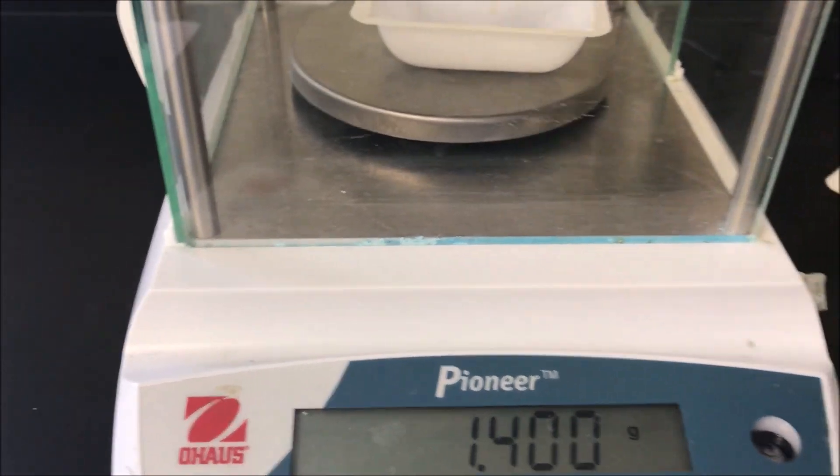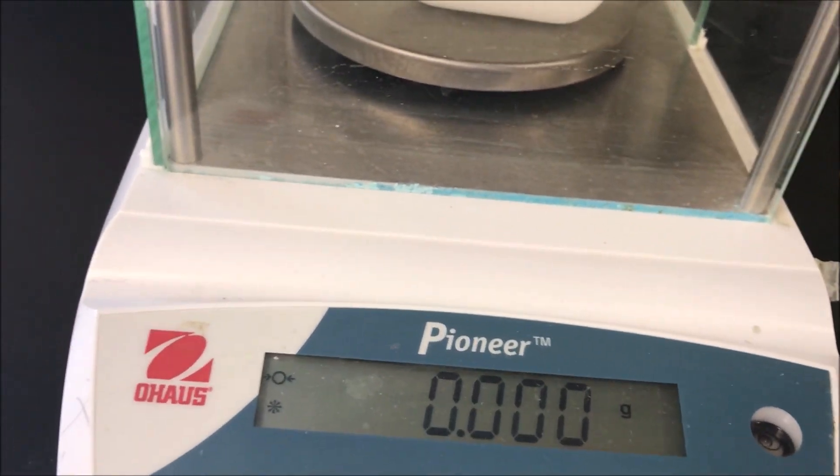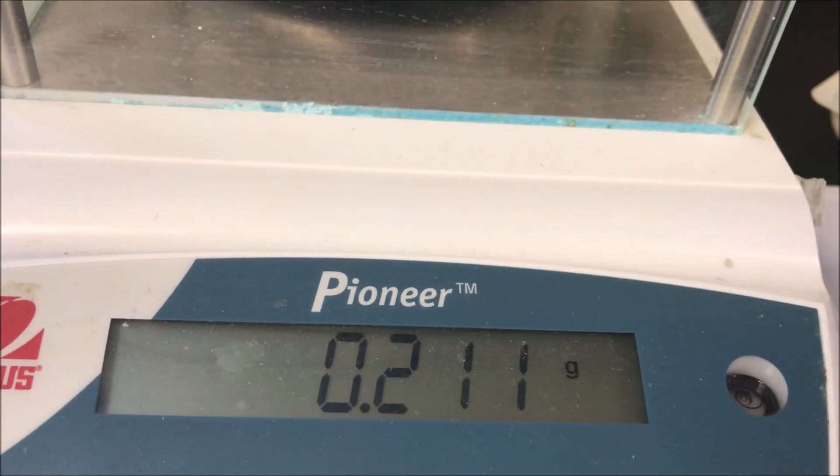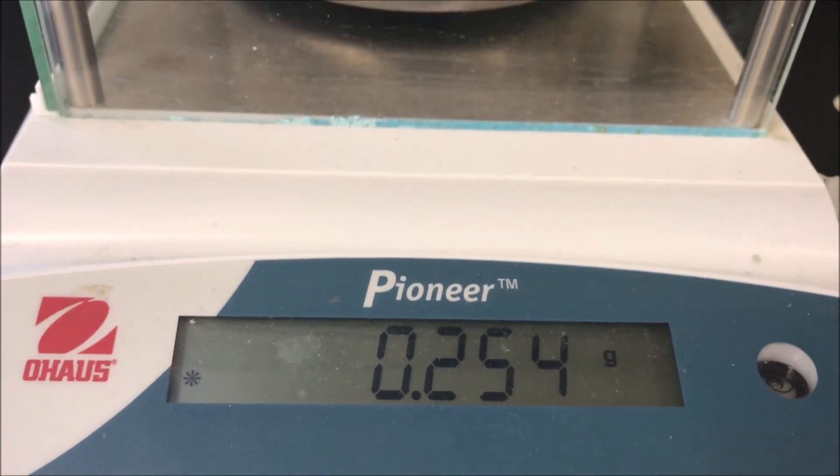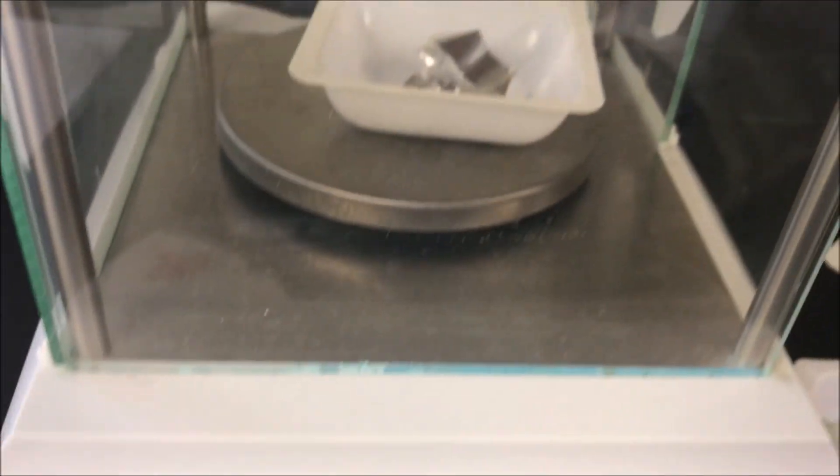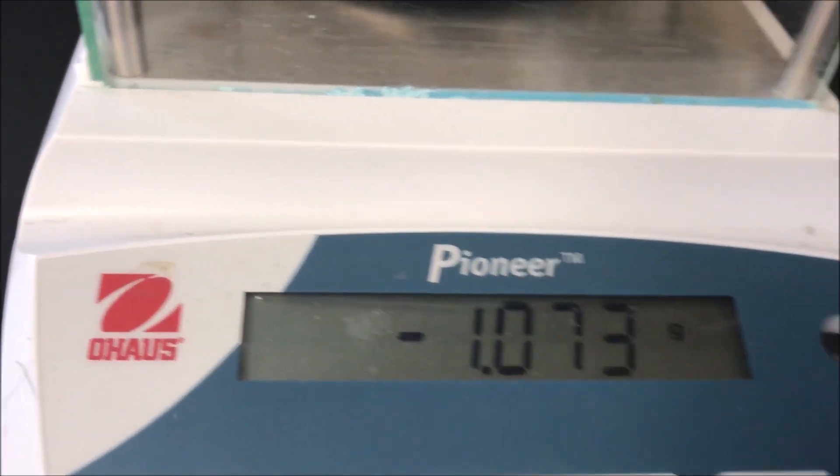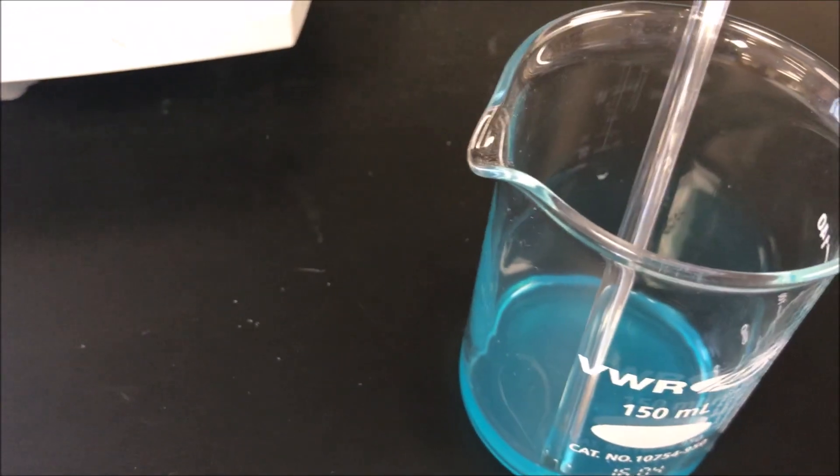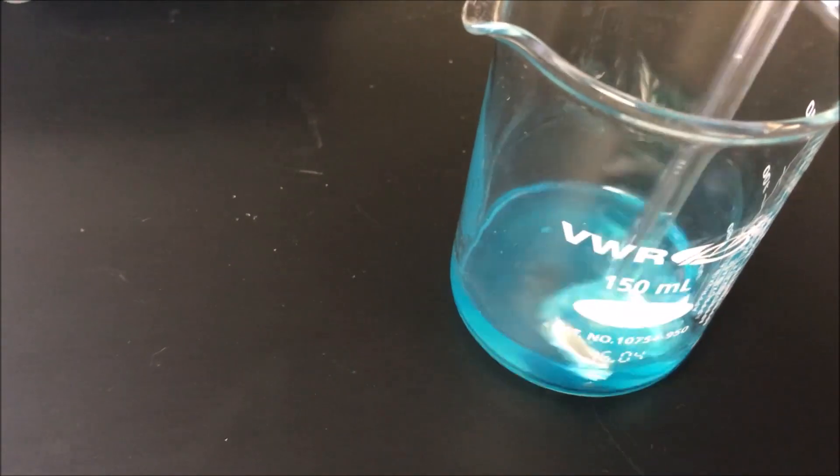Now weigh 0.25 grams of aluminum foil. It's actually 0.254 grams of aluminum foil. Then add the pieces of aluminum foil to the copper sulfate solution.